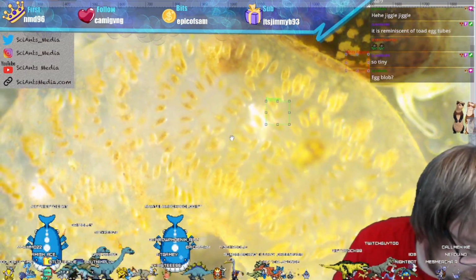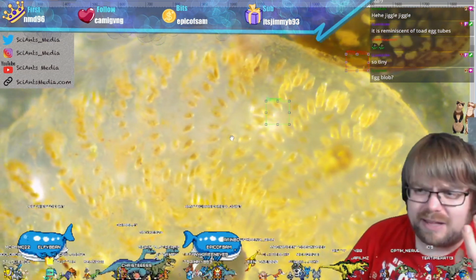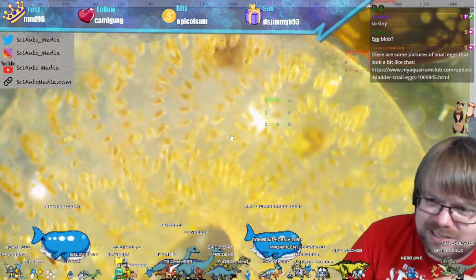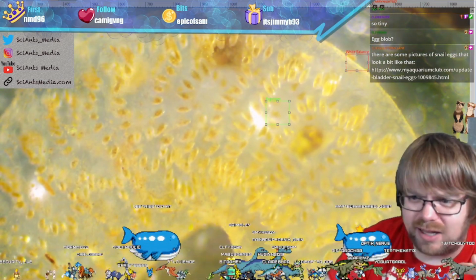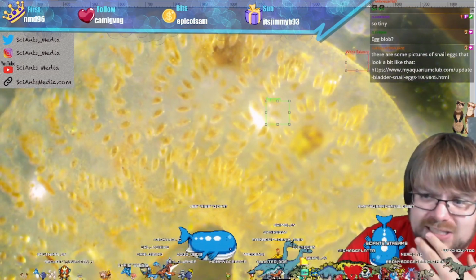It was among the plants, and I was looking in the tube. I'm like, this looks weird. Let me throw it under the microscope. Which is, by the way, some of my favorite kind of science, right? If you have something like, oh, this is weird, let's take a look. And we see something cool.